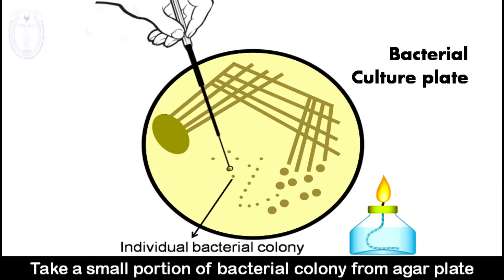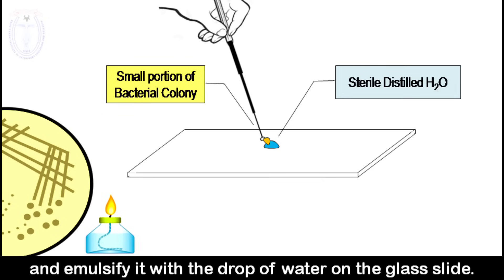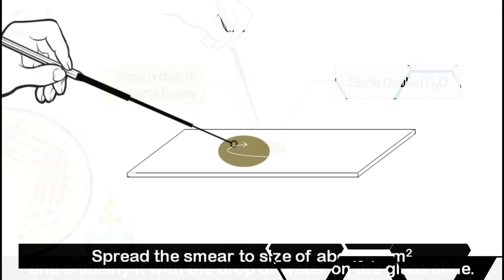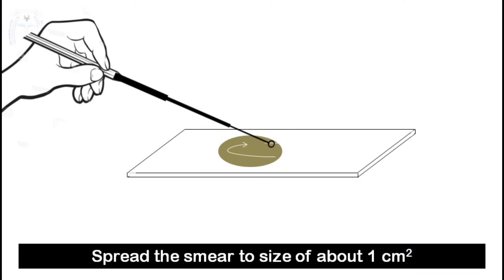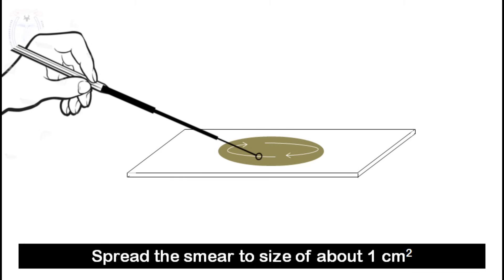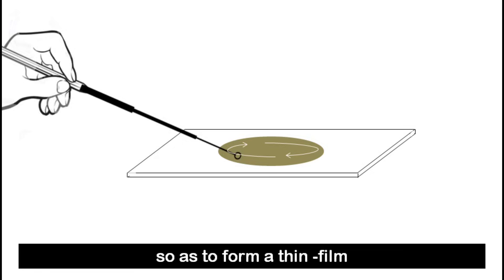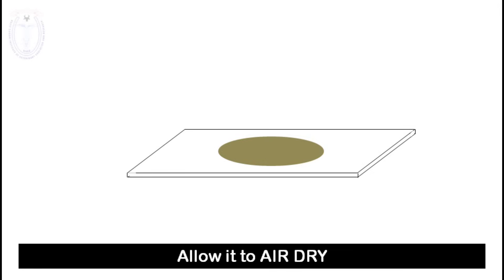Take a small portion of the bacterial colony from the culture plate and emulsify it with the drop of water on the glass slide. After emulsifying, spread the smear to the size of about one centimeter square so as to form a thin film. After spreading, allow it to air dry — it may take two to three minutes.